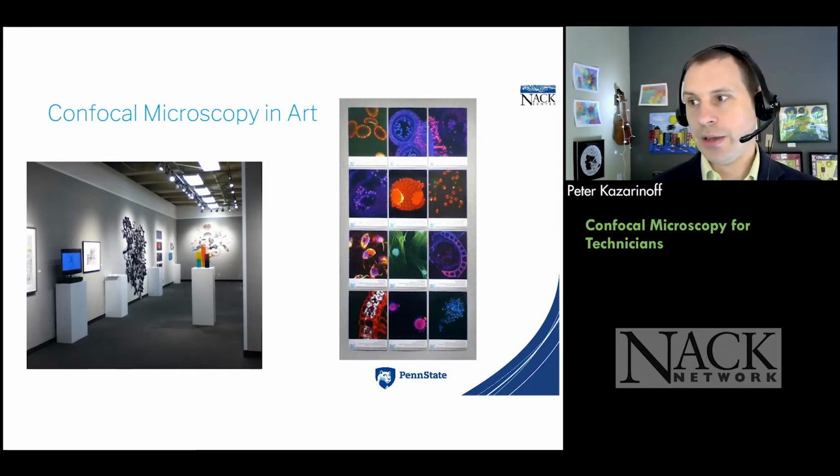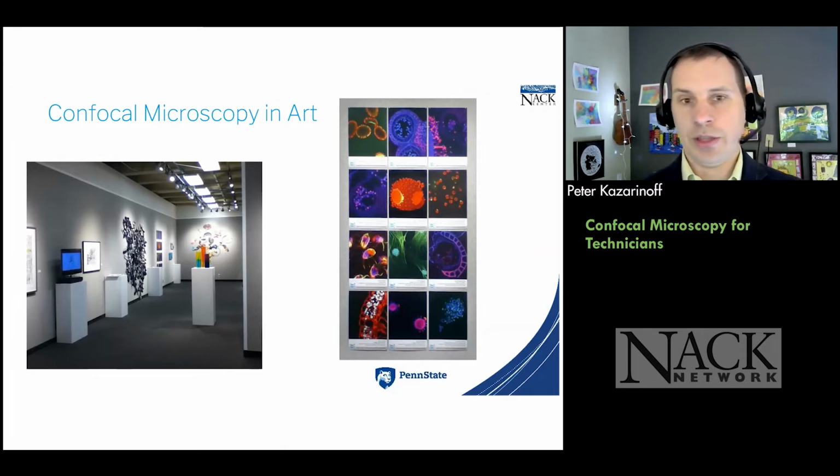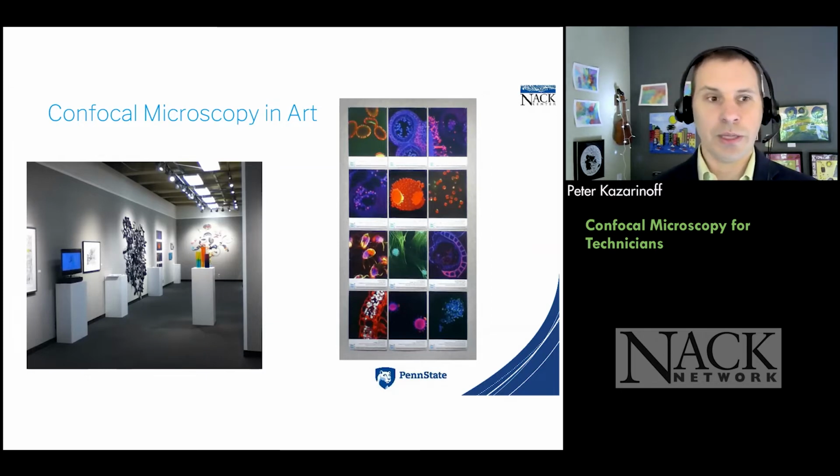And we hoped that that would increase our enrollment when art students saw the amazing images that we could create with the laser scanning confocal microscope. On the left-hand side, you can see the art exhibit, and on the right-hand side, you can see examples of student-collected images during our technician training program that were collected with the laser scanning confocal microscope.